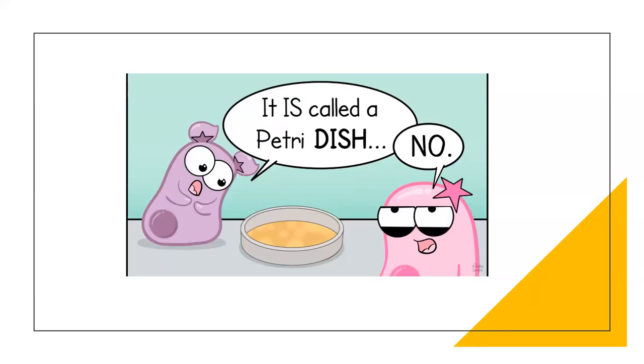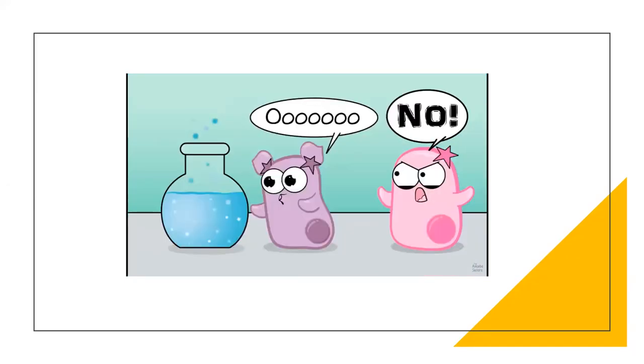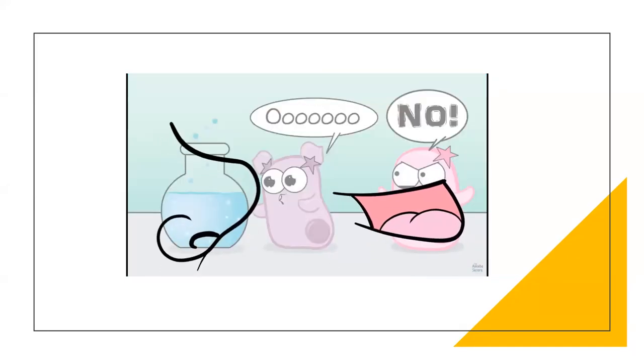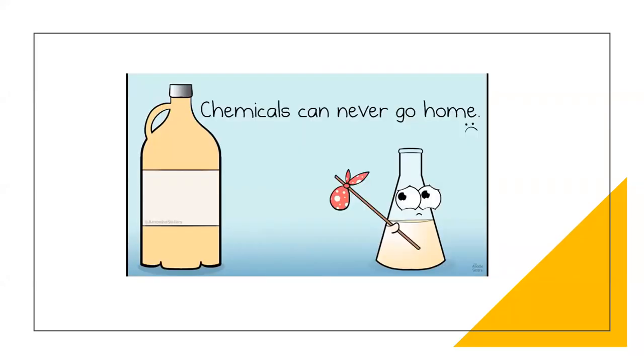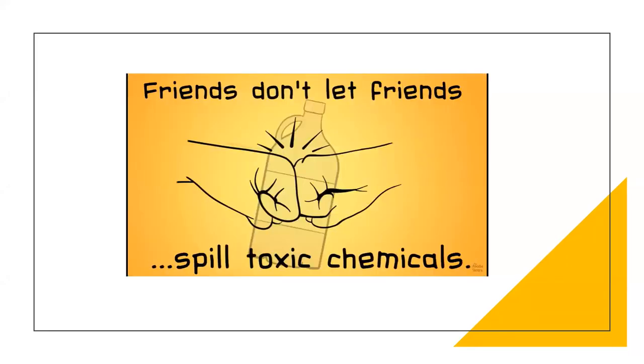Never drink or eat anything in the lab. That includes chemicals. Don't taste or smell chemicals. Read labels. Don't ever pour chemicals that you may be using back into the bottle that they came from. As soon as you finish pouring chemicals out of a container, the container should be immediately closed.